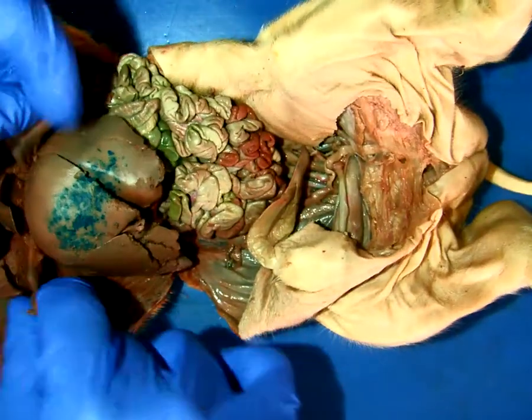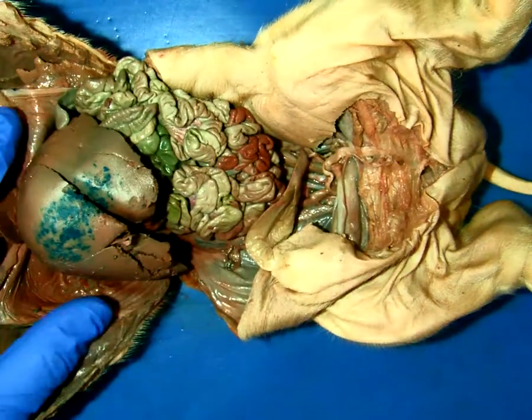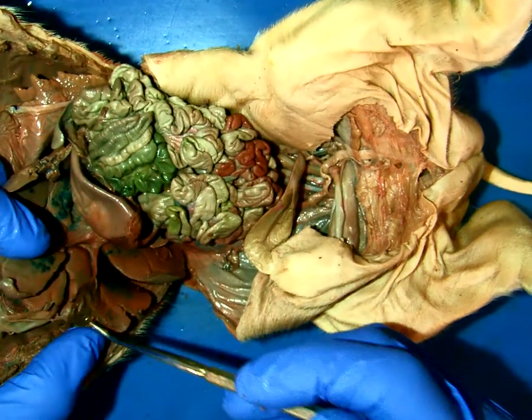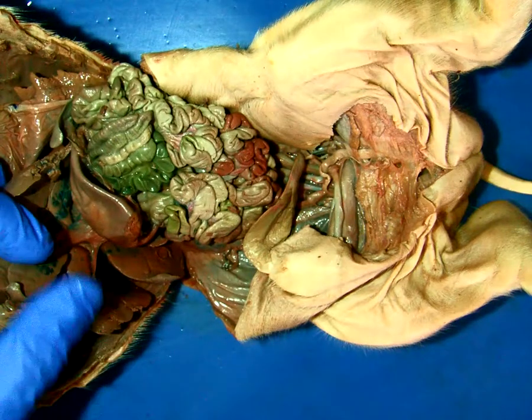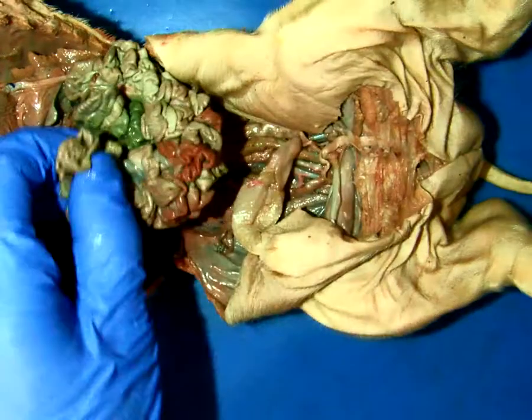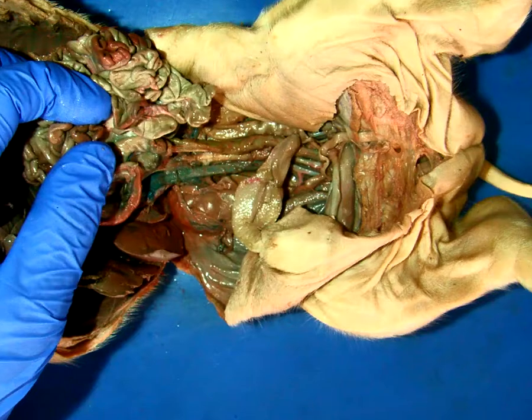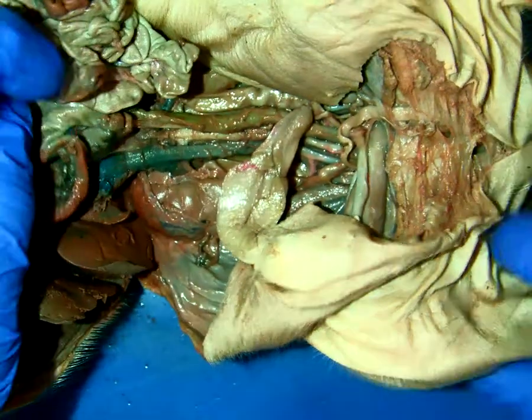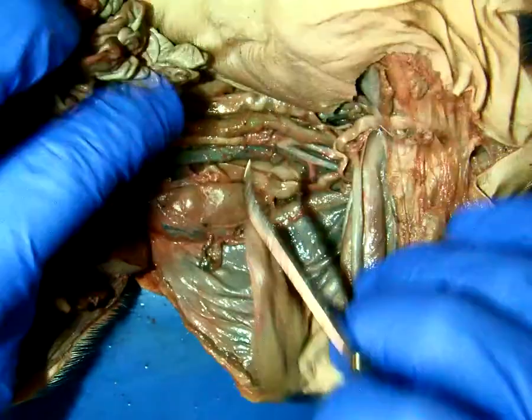So again, here now in my hands, this is the diaphragm. This is liver, right? So here, let me get the liver here. Huge liver. Gallbladder is always detectable because it's actually kind of greenish here, but it's always a different consistency under here, and we'll get to those. But let's move the stomach a little bit aside, and let me see if I can zoom in just a bit. Hold up. That's a little too far. There, about there. Okay.